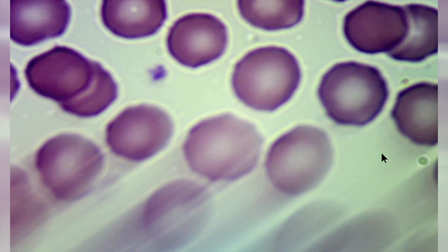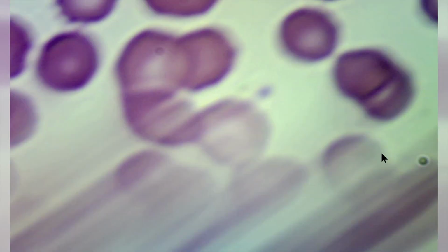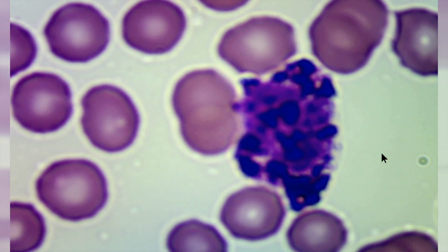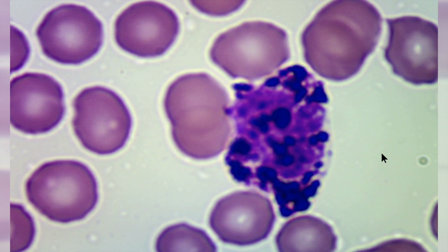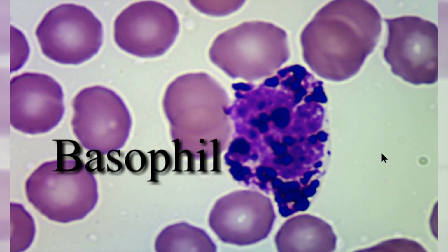They have granules that are large and dark, basically black in color, and inside those granules we have histamine and heparin.